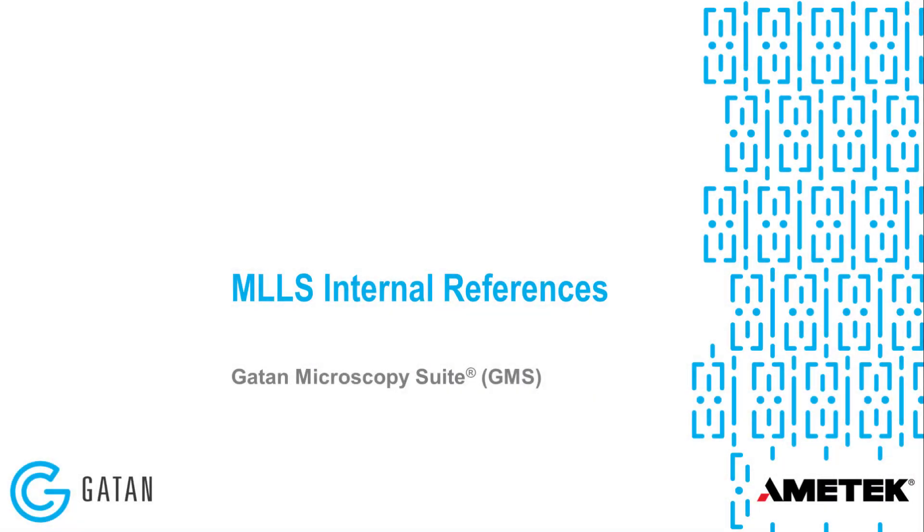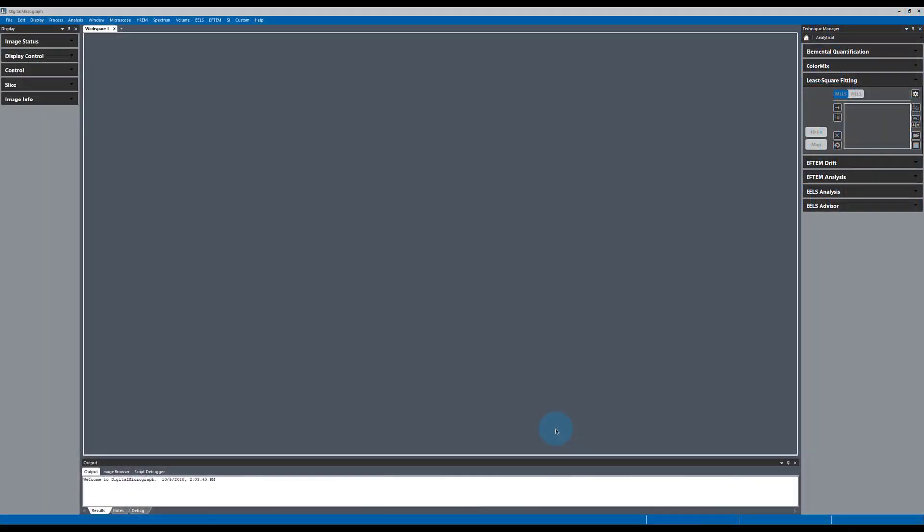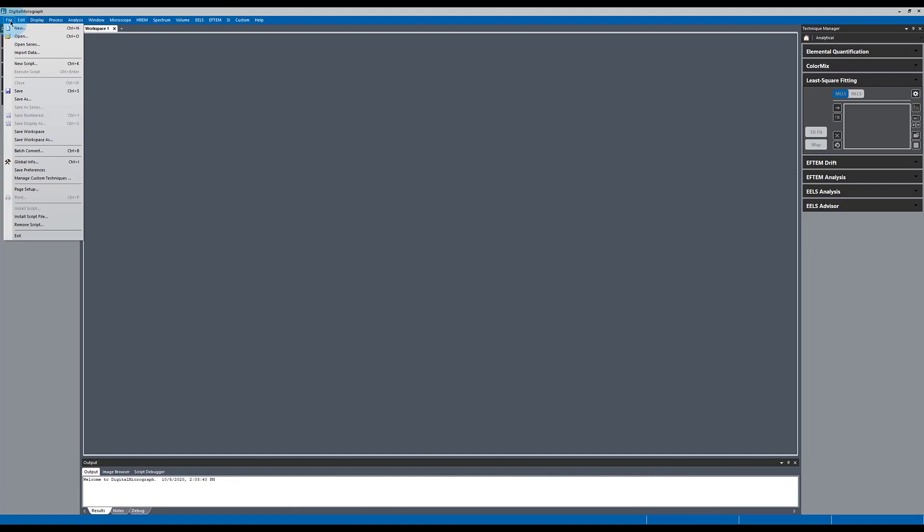We'll talk about multiple linear least squares fitting using internal references. Let's get started by opening some data.